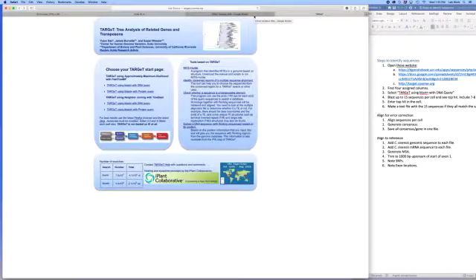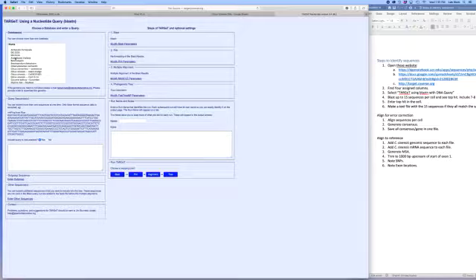So what I did was take all of the sequences that were used to design the PCR primers. I made a BLAST database, using Target with BLAST DNA query. Here we have the DG clock. So it's like a very tiny BLAST database with something like 12 genes in it.